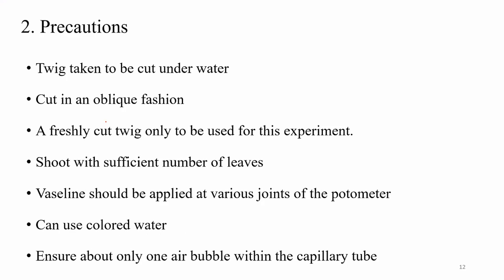That's why we apply Vaseline to the joints. And we can use colored water for clear observation and ensure only one bubble is taken within the capillary tube. So these are some precautions, which we already discussed during the practical session.